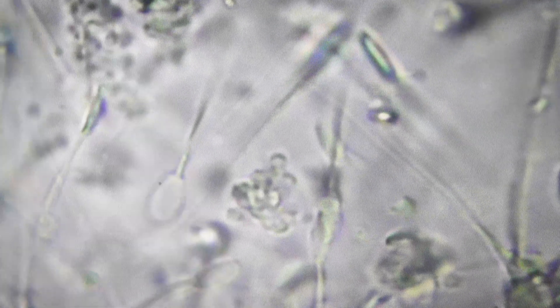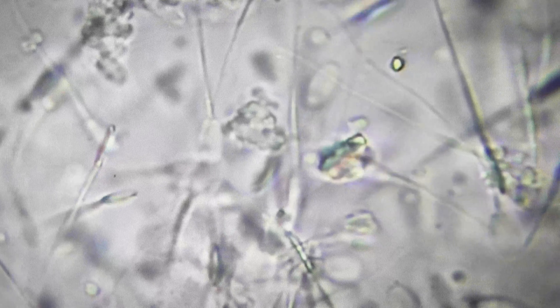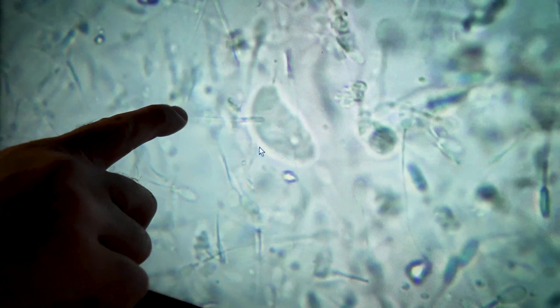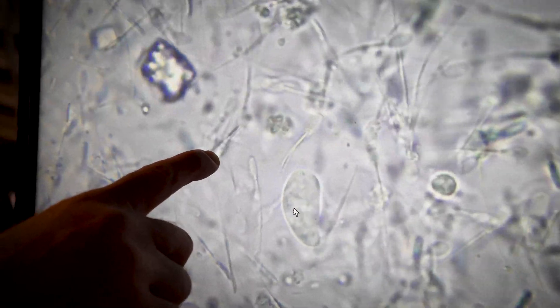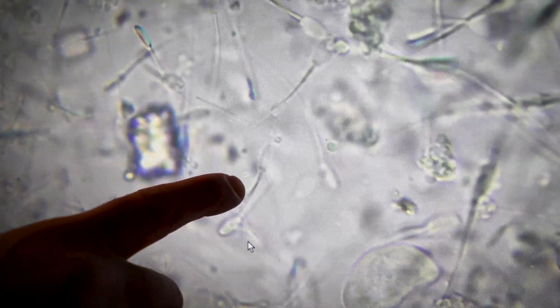What we're now looking at is the previous ram's results having been left for an hour. After an hour, there's very little movement. But because there's less circulation, we can see in detail any shape difficulties — it's easier to look at any morphological problems, problems with the shape of the sperm. If we look at this here, we've got a sperm cell — you can see the head, the mid piece, and then the tail is bent. You don't want too many of these.